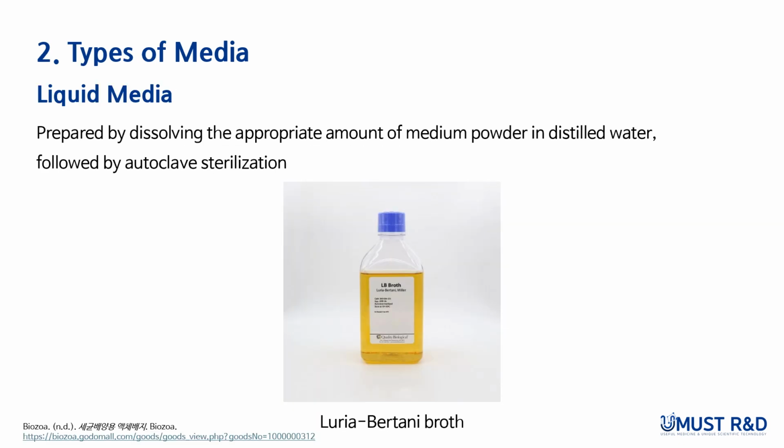As mentioned earlier, culture media can be categorized into three types based on physical state: liquid, solid, and semi-solid media. Liquid media are in liquid form and are prepared by dissolving powdered media in distilled water, followed by autoclave sterilization. A commonly used liquid medium is LB broth.